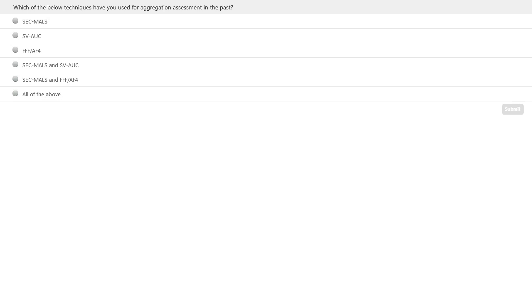Thanks, Joe. Again, this is a bit of a fact-finding mission on my side of things. As Chris and myself have said all the way along, we do try and keep ourselves at the forefront of instrumentation, and we know that field flow fractionation is, if you like, an up-and-coming technique to try and understand and define aggregation profiles, and we are just trying to gauge how much interest or need our clients and potential clients have with regard to this new technique.